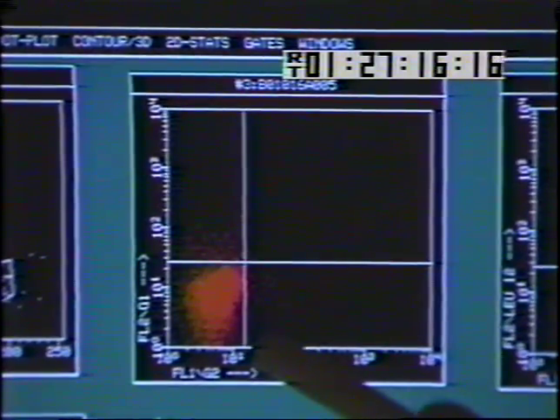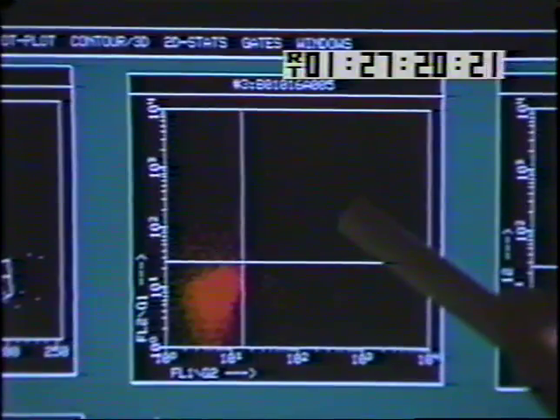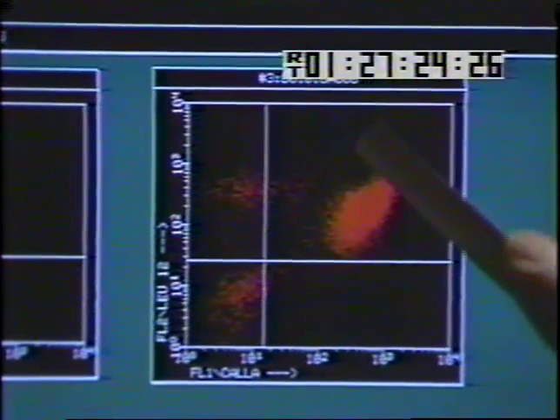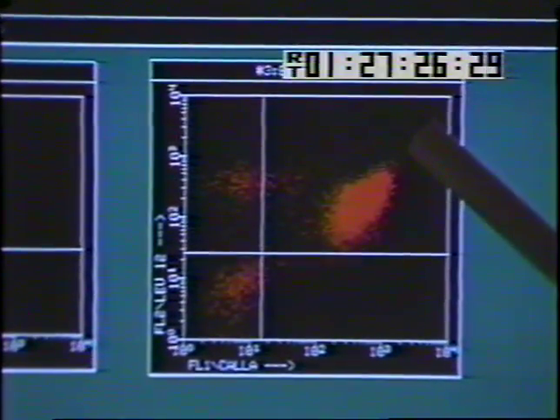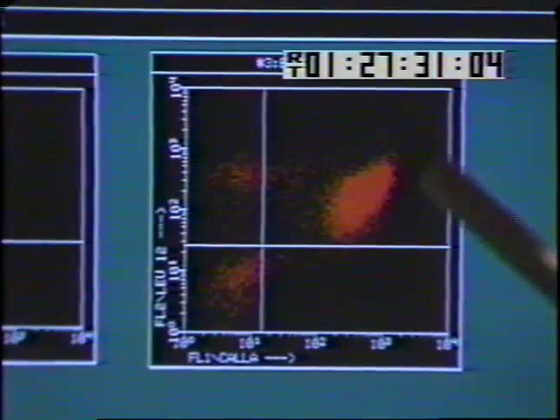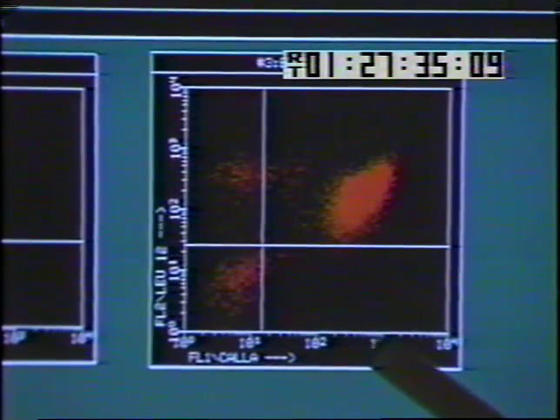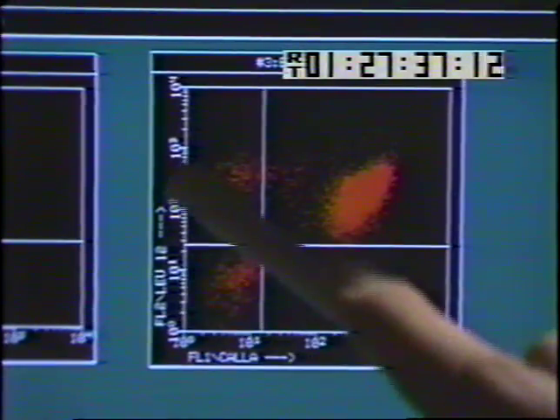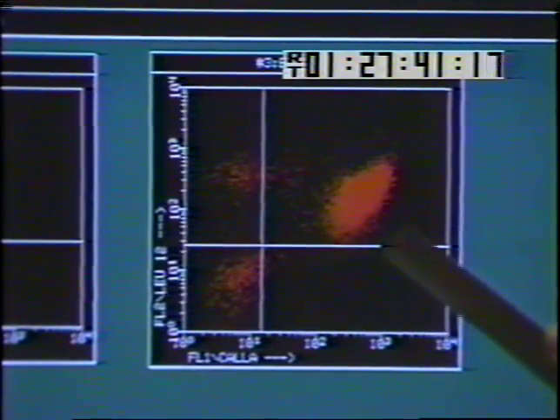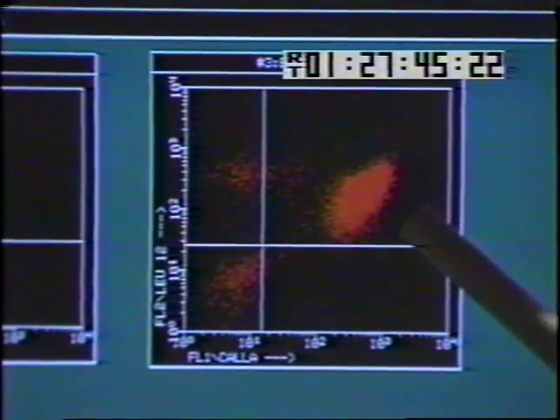In this first panel, we can see that there is very little nonspecific staining. Here is where the unique population of leukemic cells becomes apparent. This particular position of cell or cell cluster would never be seen in normals. It is a combination of an immaturity antigen with a marker of B cells. So already, just by this unique cluster of cells being present, we know this child has a leukemia.